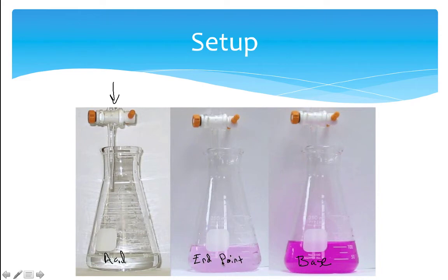Just as the solution starts turning from acid into base, we get this faint pink color, and this is the place you're looking for. And if your reaction's set up very carefully, your endpoint will also be very similar to your equivalence point, and it will provide you with the necessary data needed to do the stoichiometry calculations in order to determine the concentration of your unknown acid.